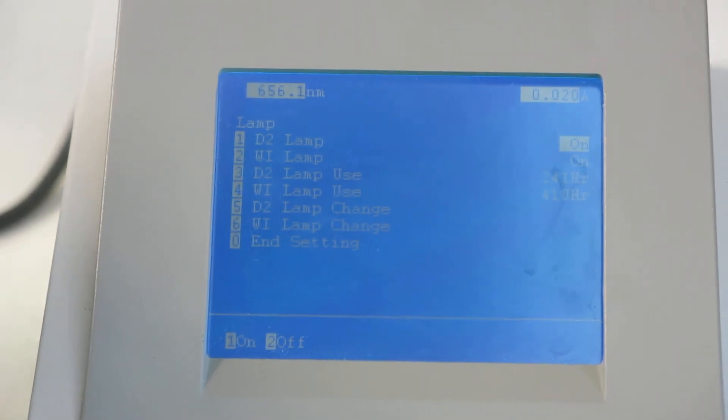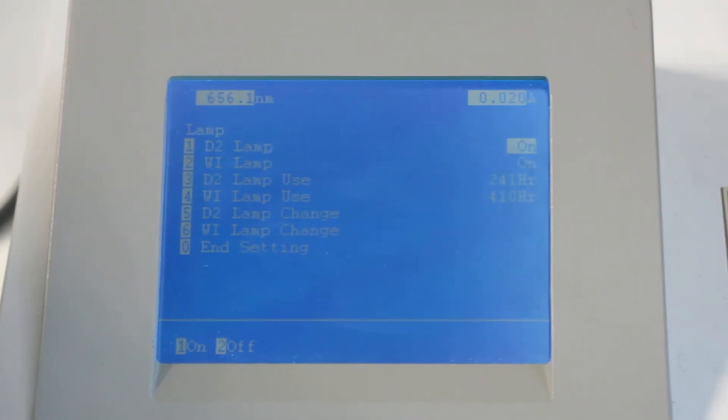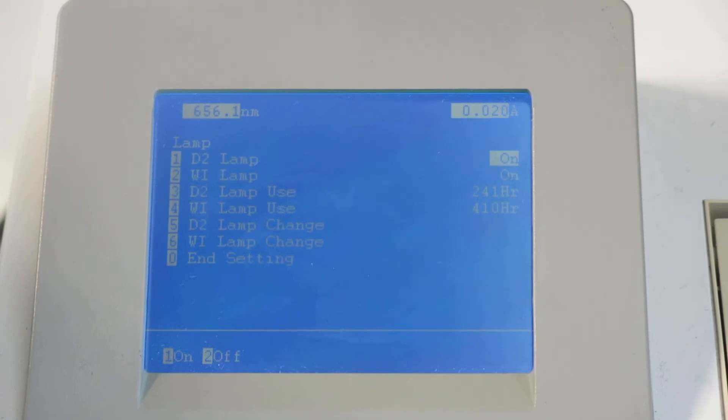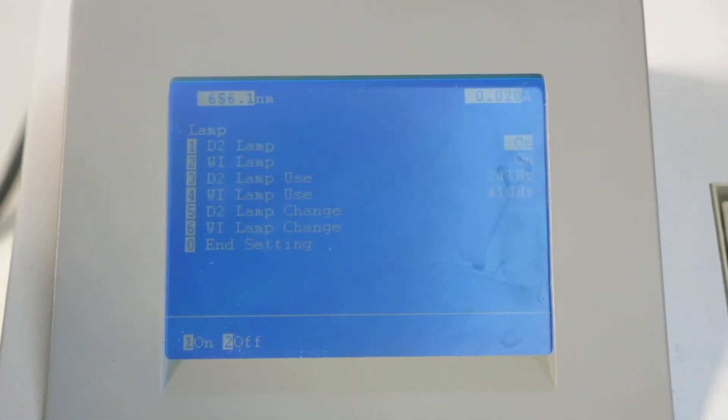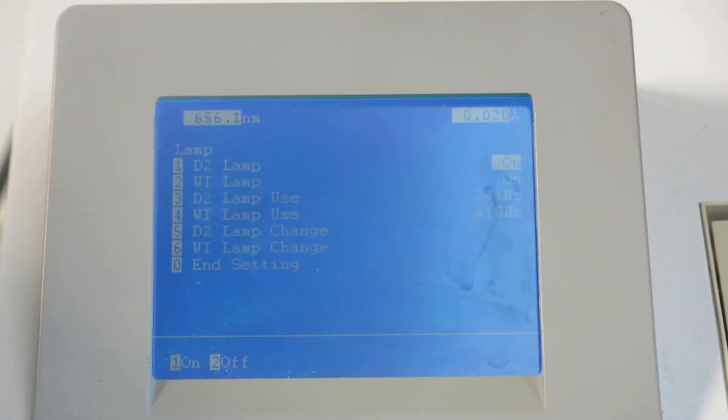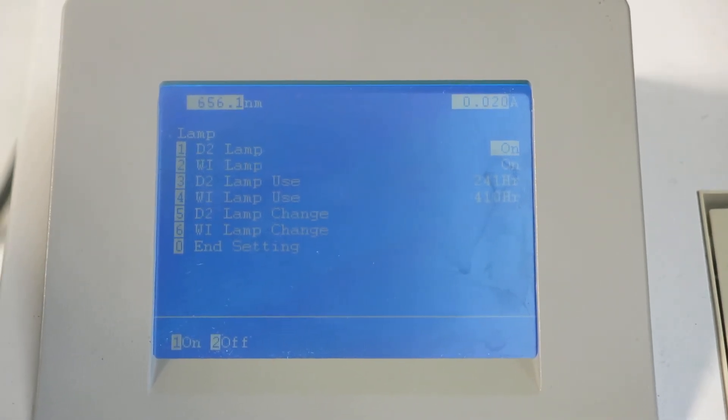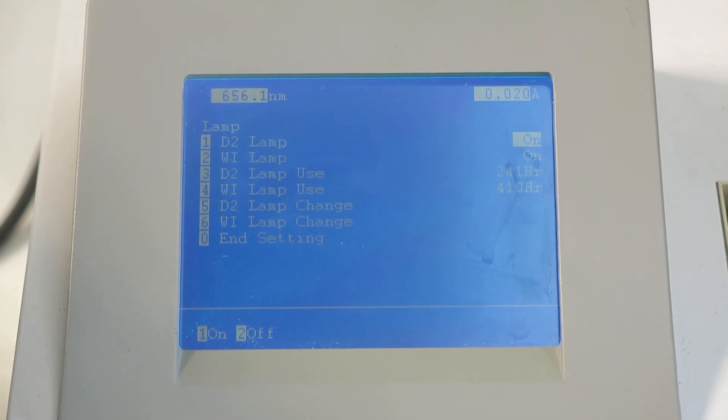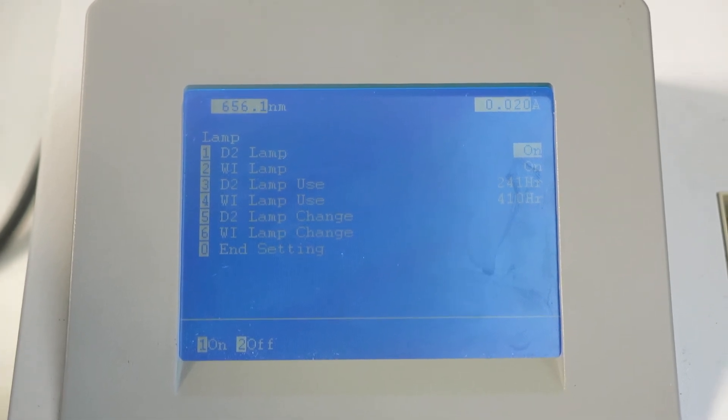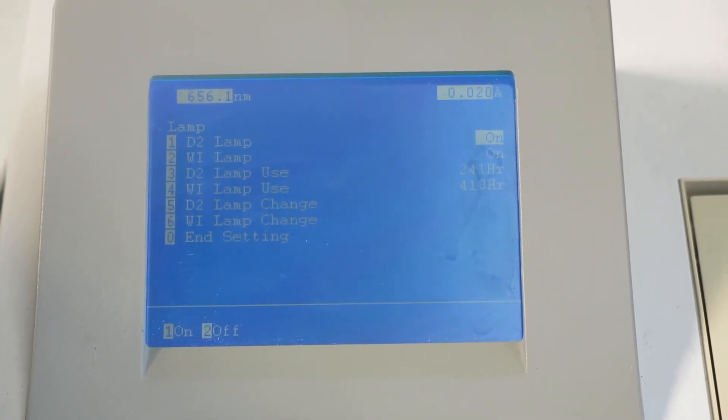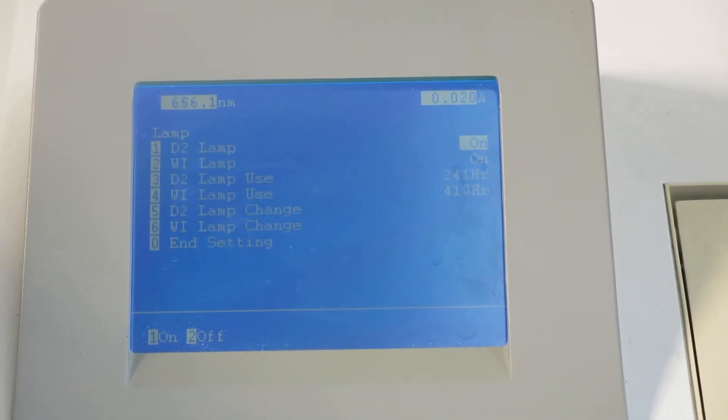Again, the U1800. An extremely good instrument. The beauty with this is the fact that we can supply it for a limited, nominal amount with software, which is UV solution software, and a cable to enable it to be run from a PC. And that's a pretty simple thing to do.